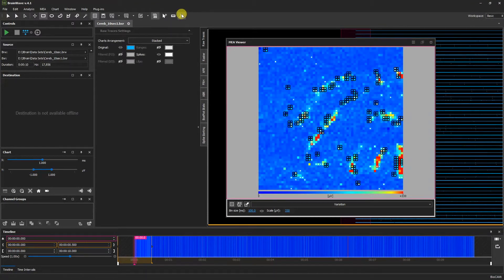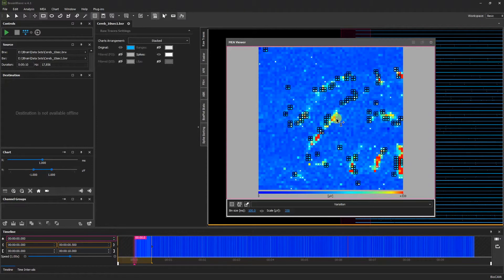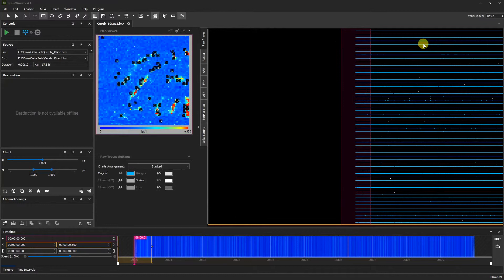Finally, we have a counter tool which, when selected, allows us to click and place different counters across our MEA viewer map. To return the MEA viewer to the dock, click the dock back button.